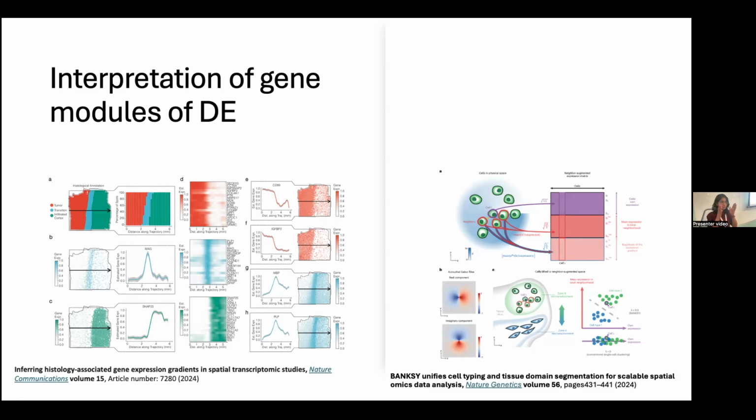So they selected just 2 regions and did differential analysis, and they concentrated their focus on understanding how the genes varied across this. So based on what I've gone through, just be a little careful when you do differential analysis. Make sure you understand what your matrix output is before you venture into that.